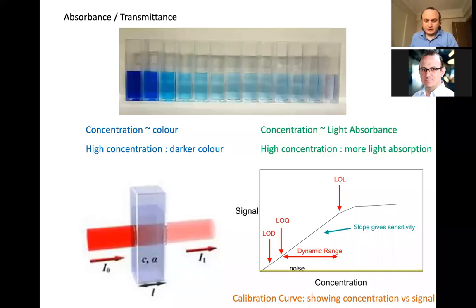Hello all. I just decided to make a summary about the light absorption and transmittance in 2 slides you'll see. As you may remember from the theoretical courses and from the lab, the concentration of the material was our purpose to determine. And to make it visible, I just picked a sample which is colorful, as you can see.